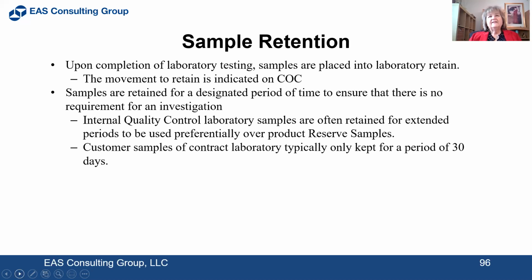Generally, people like to save their reserve samples for something more catastrophic, like the FDA has come and requested, or there's been a complaint or something. Customer samples at a contract laboratory are typically only kept for a period of 30 days. I'm sure that varies with the lab.